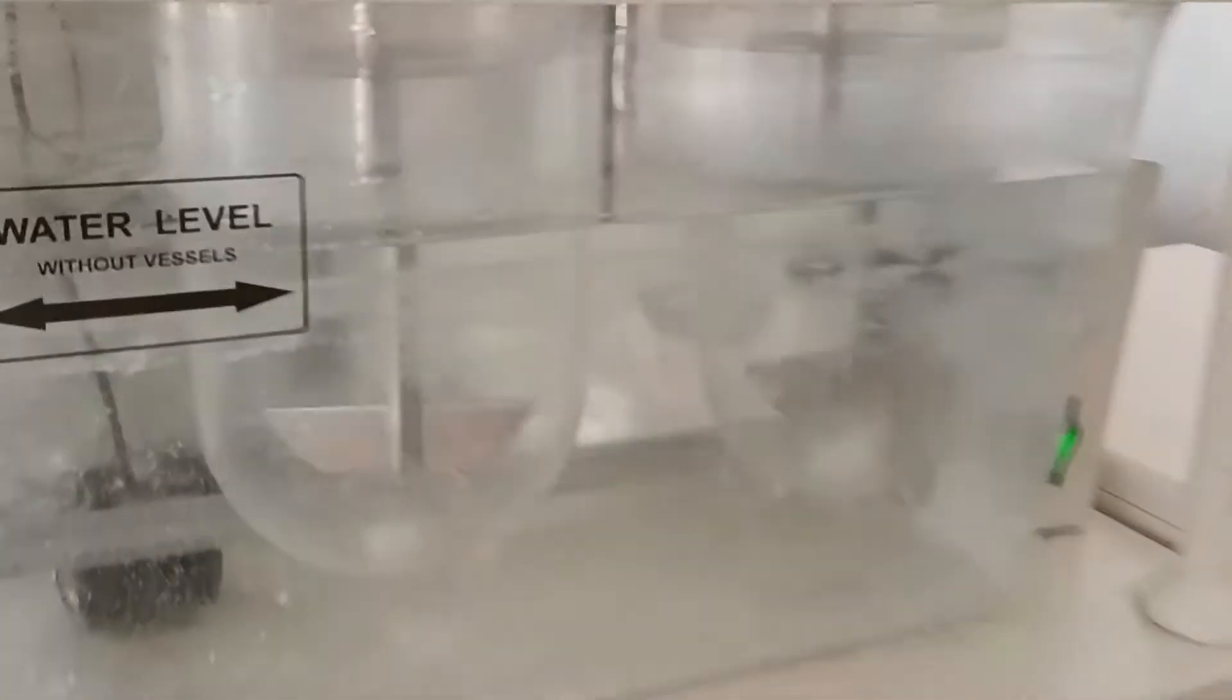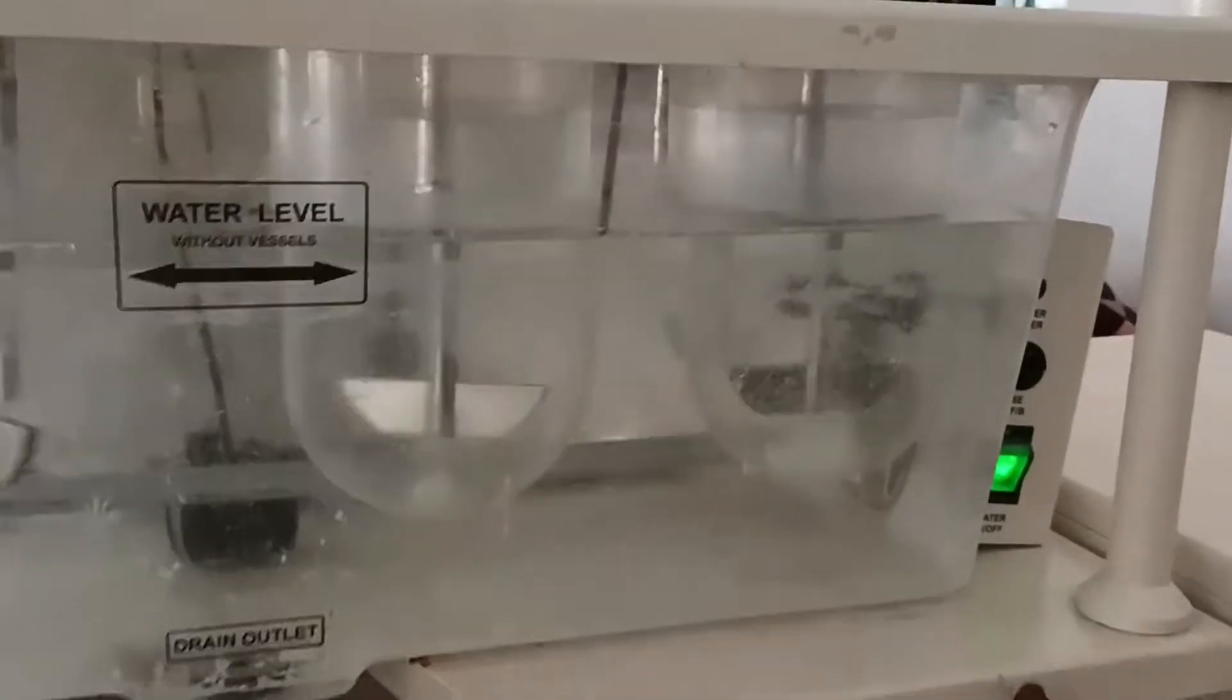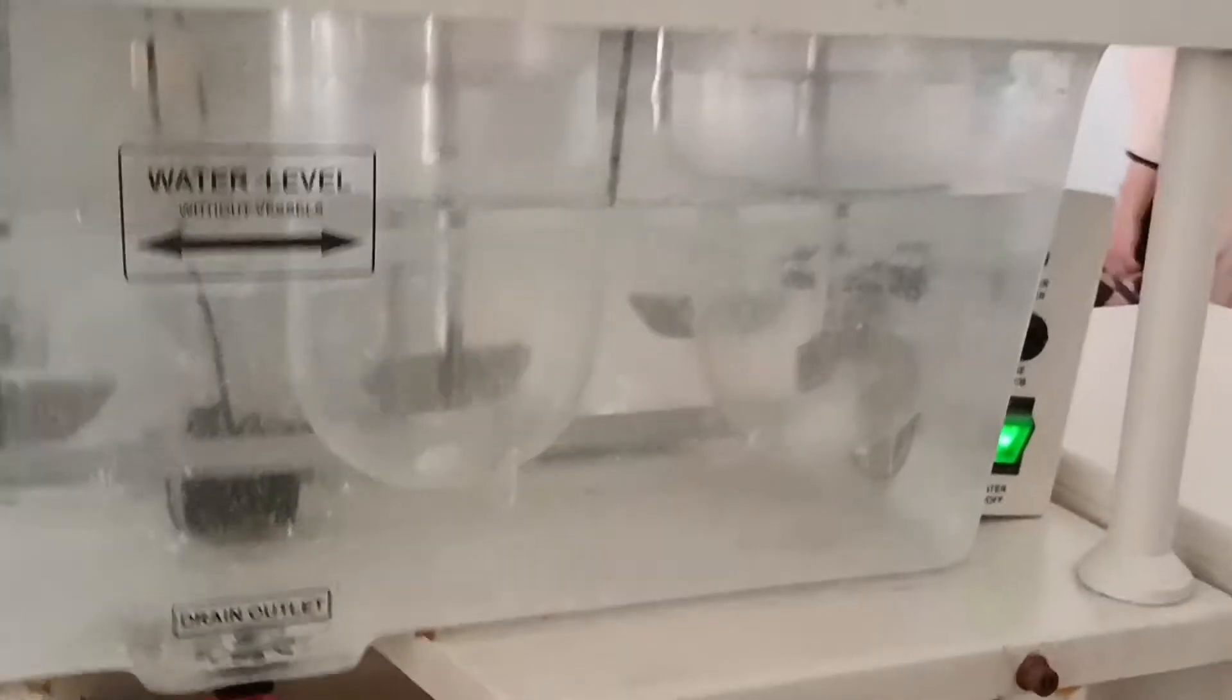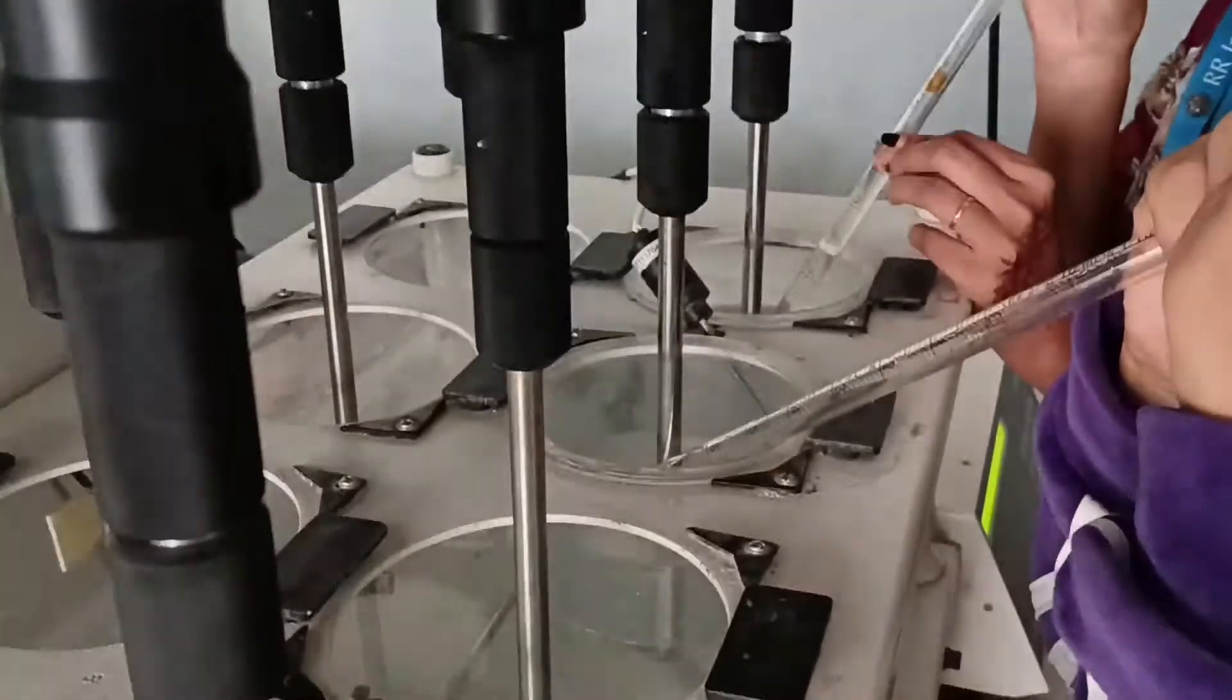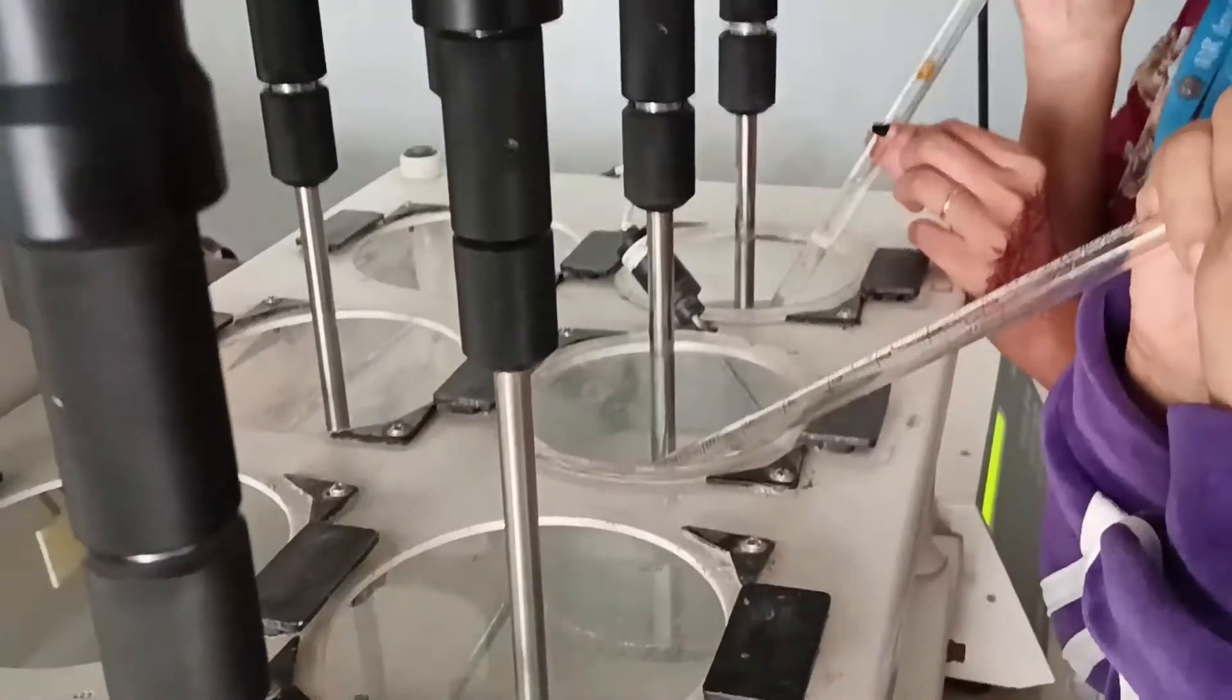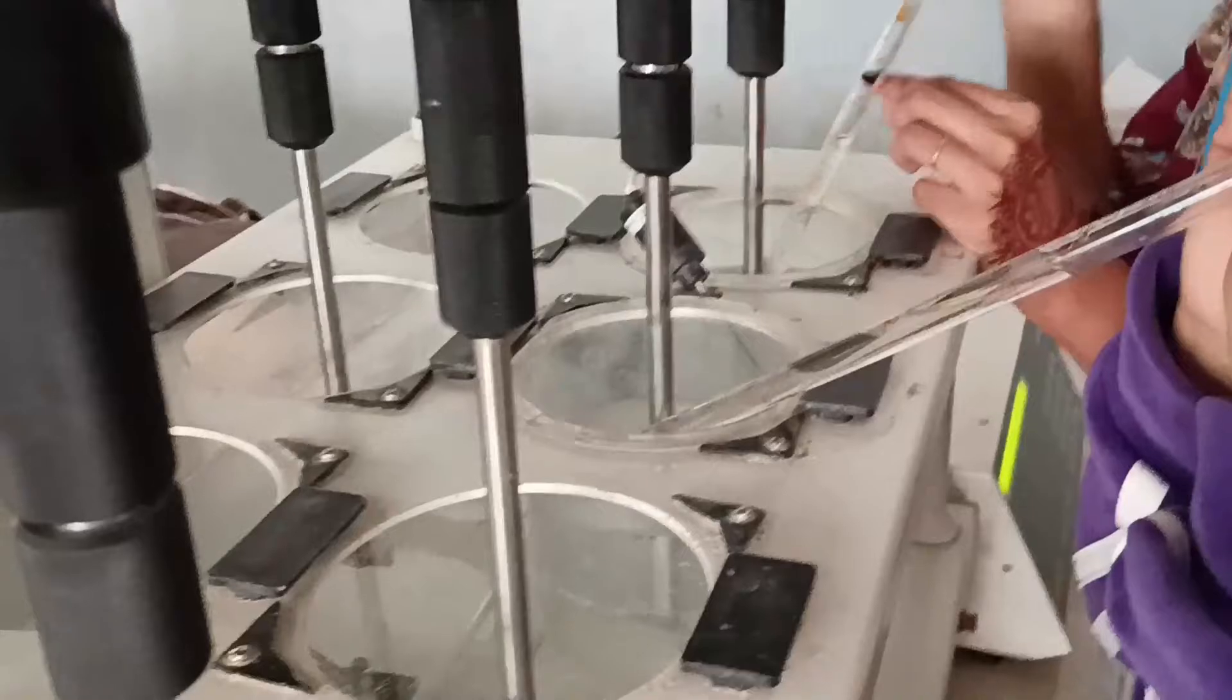Look how it is disintegrating. First it will disintegrate and then it will undergo the dissolution process. After this, you have to take 10ml from the dissolution flask.